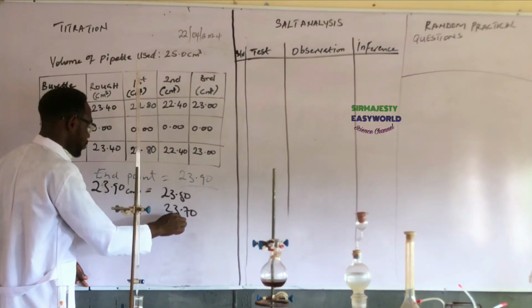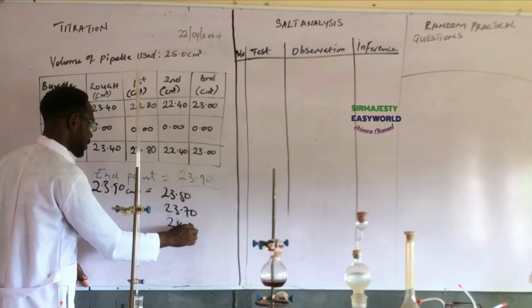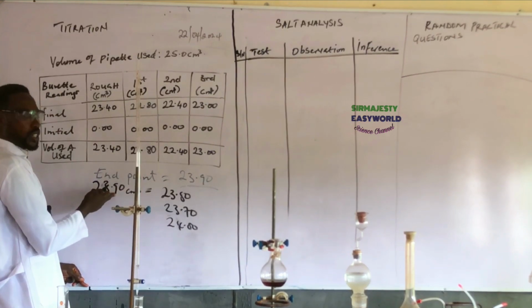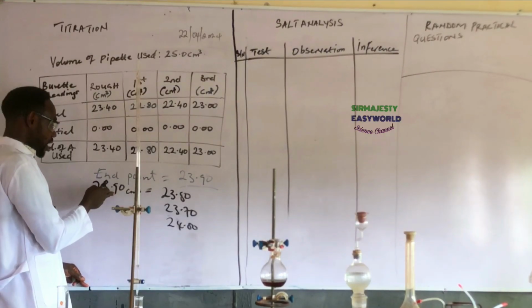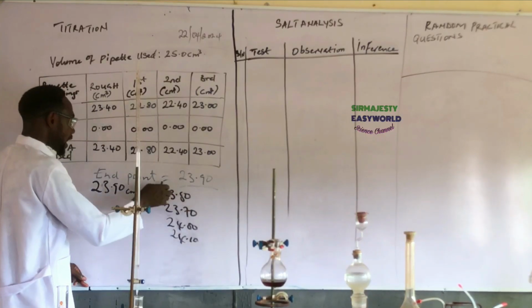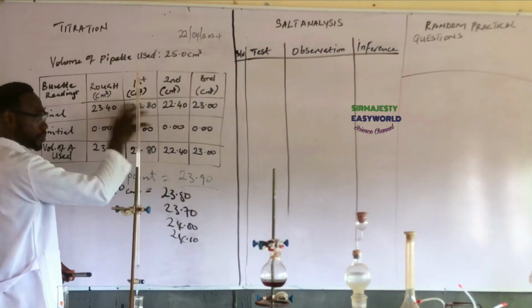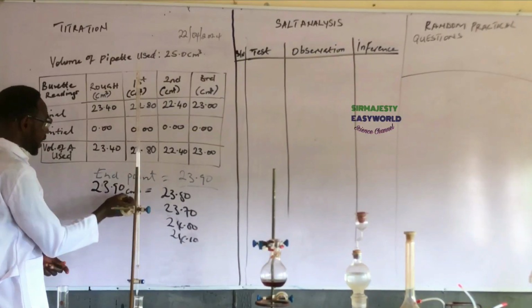I can also use 24.00 exactly, yes. The reason is because this is not more than 0.2 more. If you add 0.1 here, it is still correct. If you add 0.2 here, it will become 24.10. So any of these is accepted for you to decide as your own endpoint, not the figures you fill in this table. No. This is the number possible that you can bear in mind alongside your teacher's endpoint.